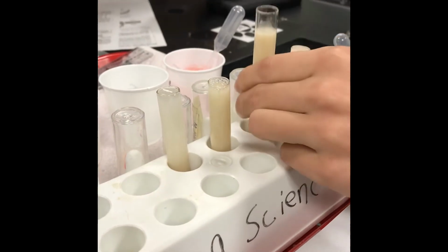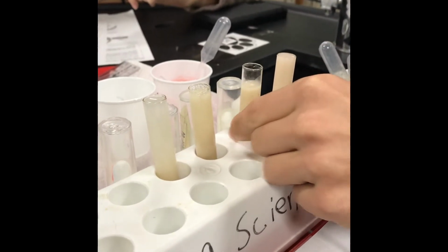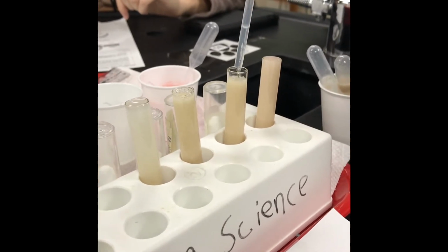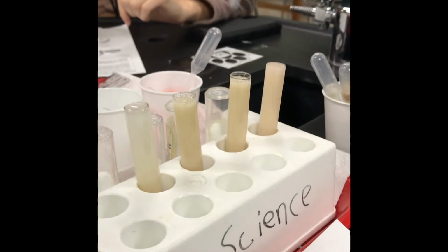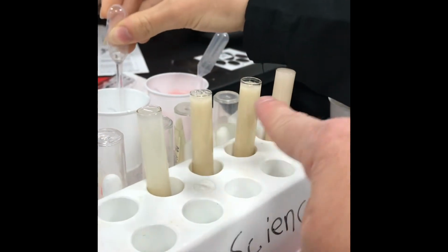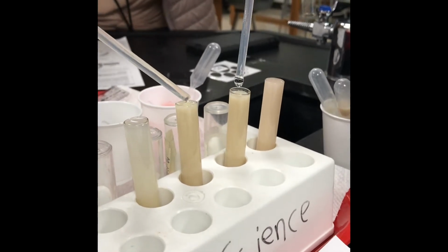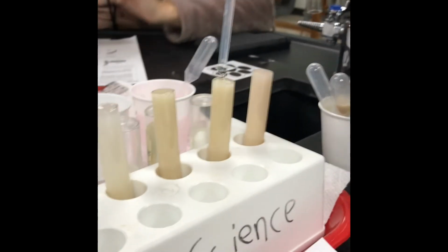And this group has a perfect 4, so they don't need my help on this. So you can see they're filling it. I would put a little bit more in this one maybe, and a tad bit more in that one. The first and fourth one are great. Okay, so they've got all 4 tubes.